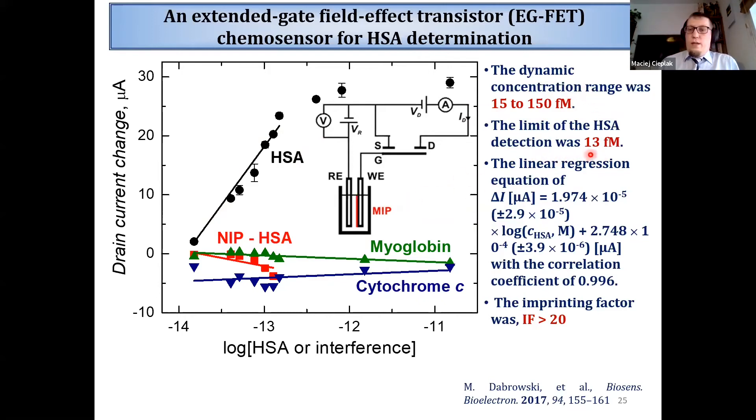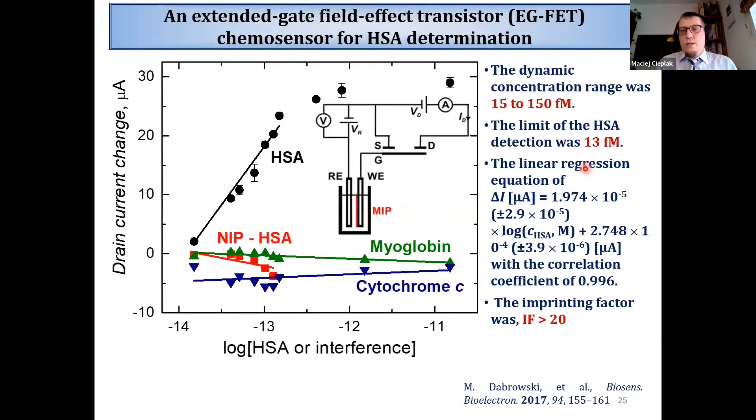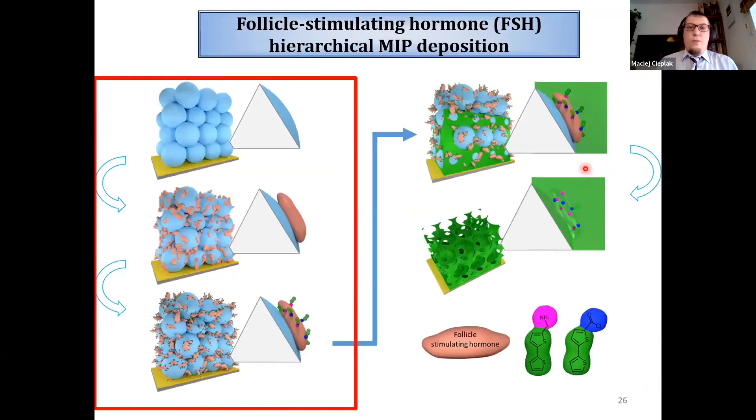However, looking more carefully at those images, we can see that because of the consecutive steps of chemical modification, the structure of the colloidal crystal was affected. It is hard to call this final MIP structure a true inverse opal - it is more similar to a colloidal glass than an inverse opal. Therefore we went for optimization of this process.